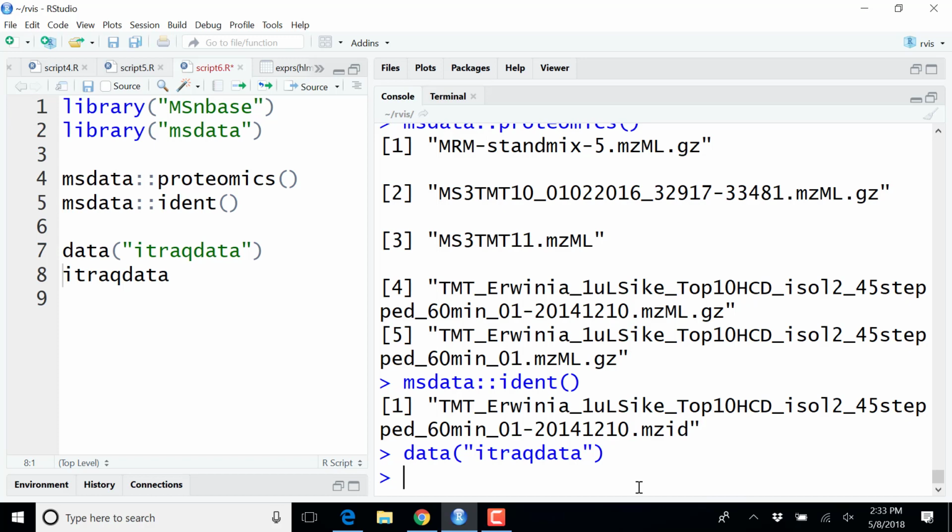And so if we have a CSV file, for example, one that is exported by MaxQuant, Proteome Discoverer, and the like, there is a function called readMSnSet2, and that one will produce an MSnSet, like the mulvey2015 data, like the hyperLOPIT data, and so on. So these are the three functions that will allow you to read different types of data in.